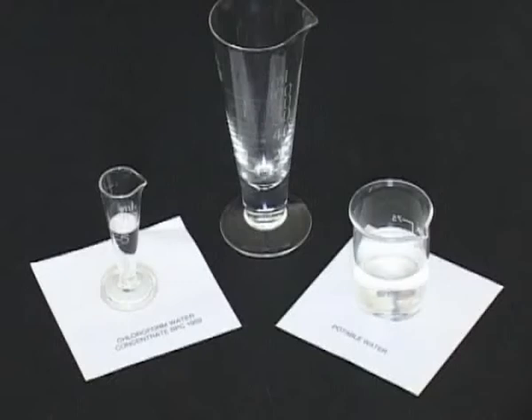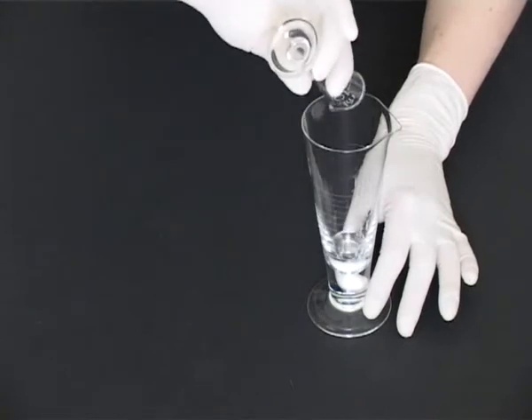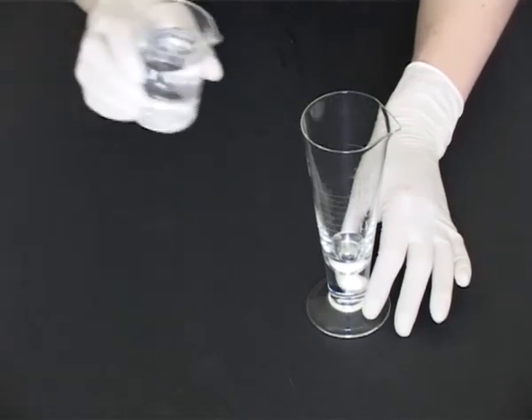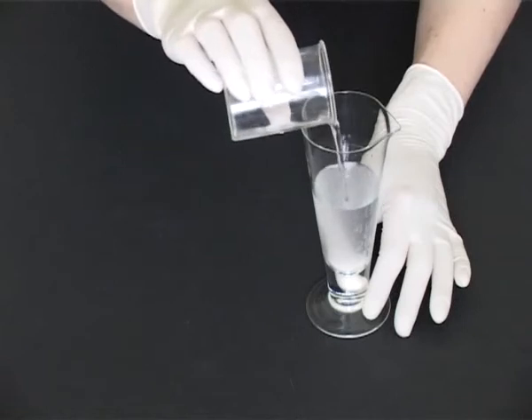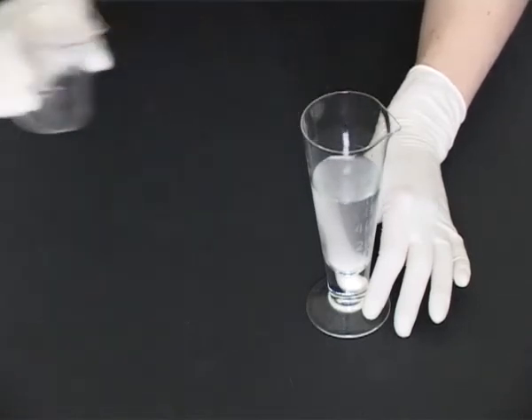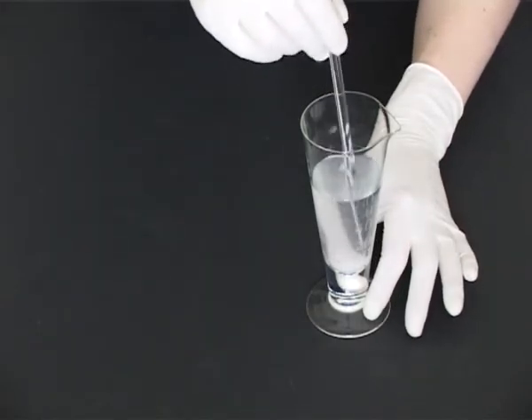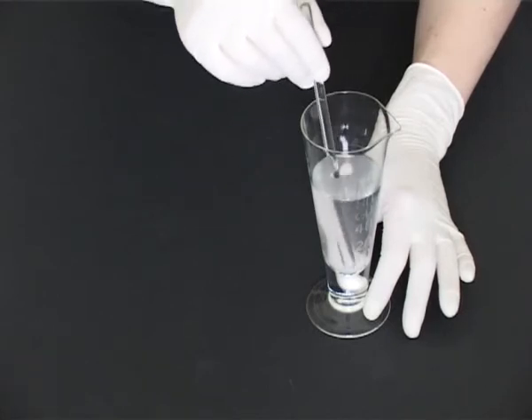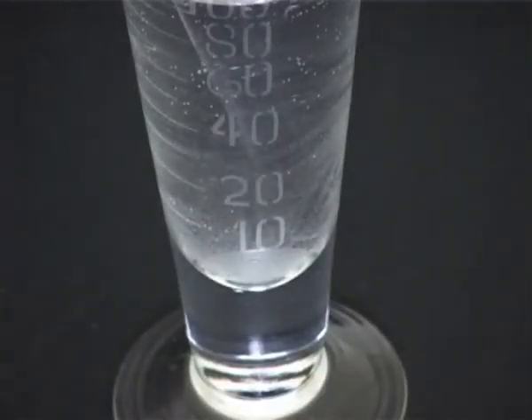If you make double strength chloroform water incorrectly — that is, concentrated chloroform water added first and then topped up with potable water — the chloroform comes out of solution and is left at the bottom of the measure. This is because when we prepare double strength chloroform water, the chloroform is at its limit of solubility.